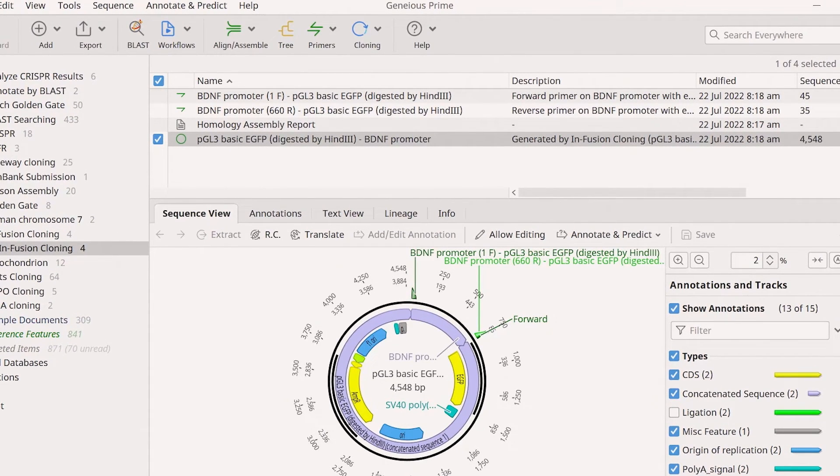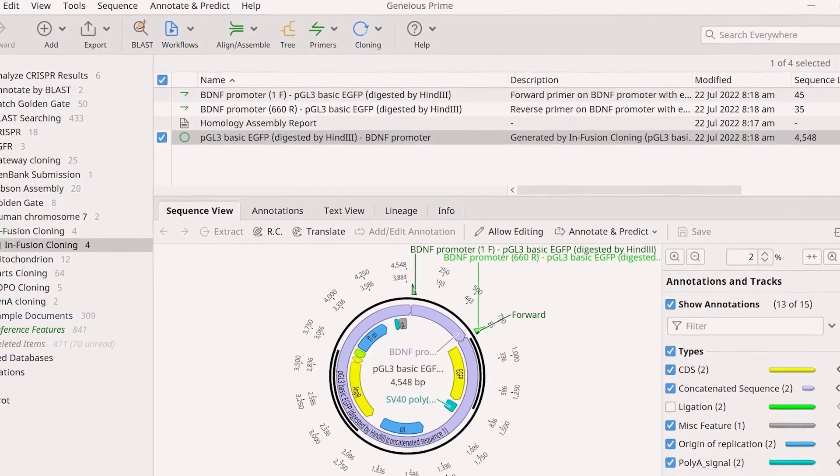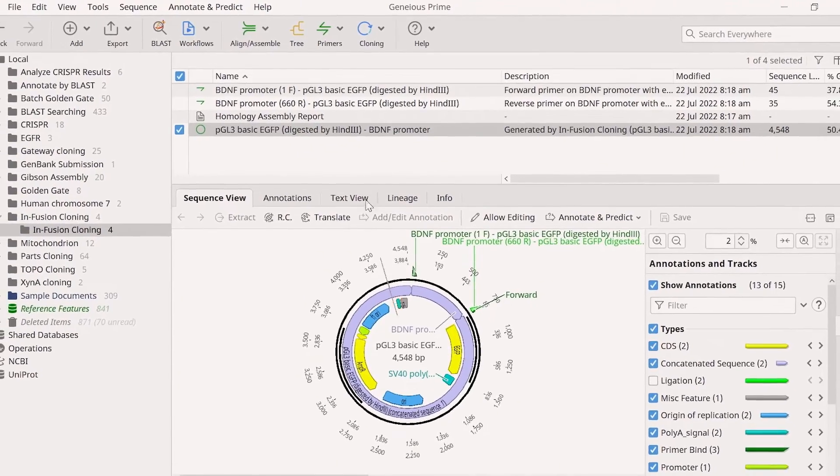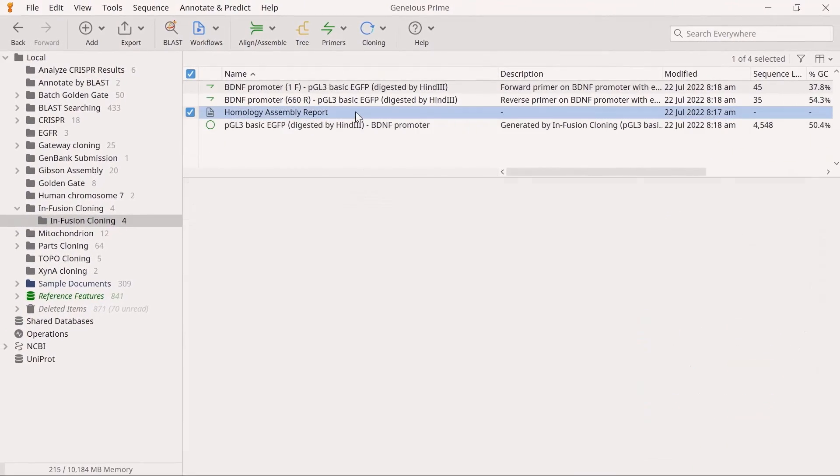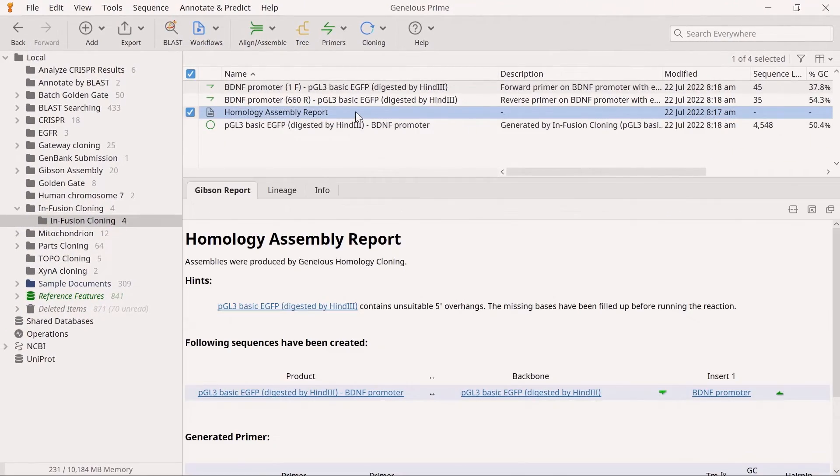A report, final product, and primer sequence files. In the Homology Assembly report, you will see a text breakdown of the simulation.